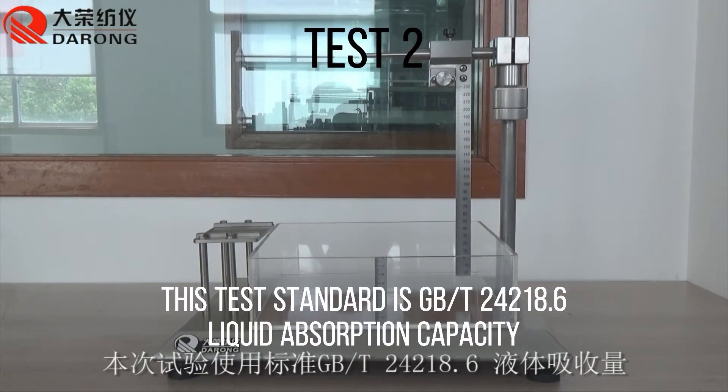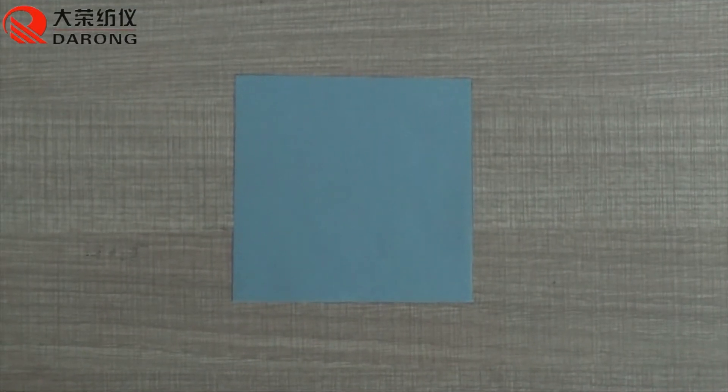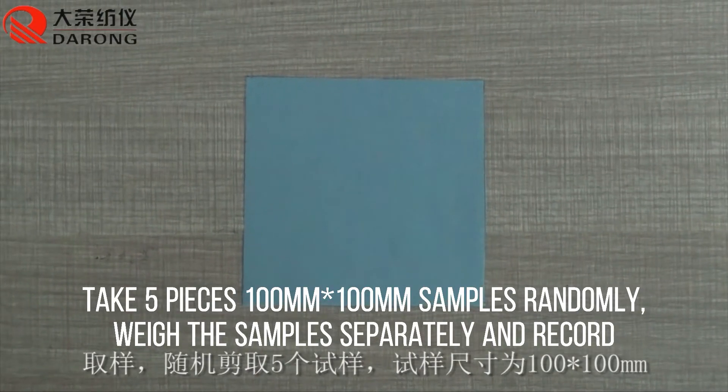The second test standard is GBT-24218.6 liquid absorption capacity. Take 5 pieces of 100x100mm samples randomly, weigh the samples separately, and record the values.